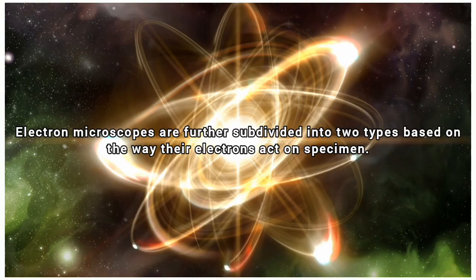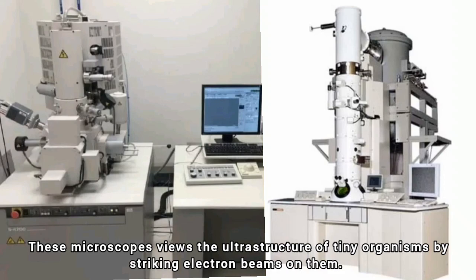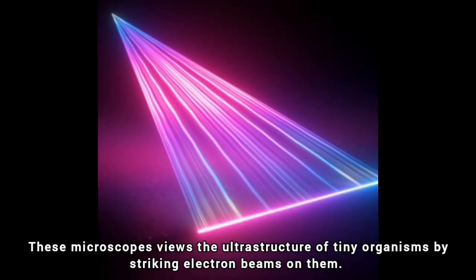Electron microscopes are further subdivided into two types, based on the way the electrons act on the specimen: scanning electron microscope and transmission electron microscope. These microscopes view the ultrastructure of tiny organisms by striking electron beams on them.